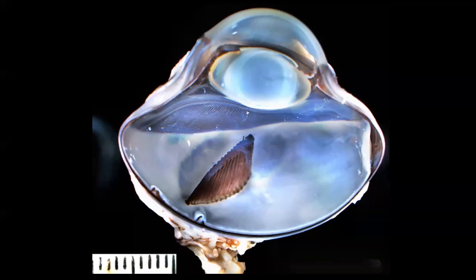For the purposes of this discussion, there's nothing special about it being a red-tailed hawk eye. There are things that are special about the red-tailed hawk eye, but we're not going to talk about them right now. But we're going to talk about some of the features of the bird eye. First thing to notice is that the shape of the eye has, I call it a pear shape. Can anybody tell me why the bird eye would have a pear shape?